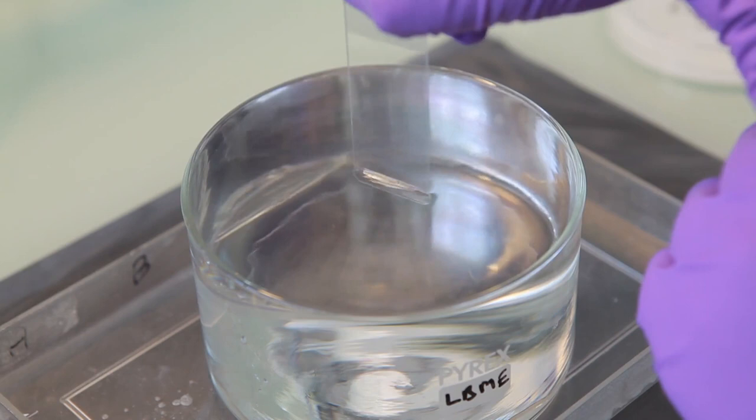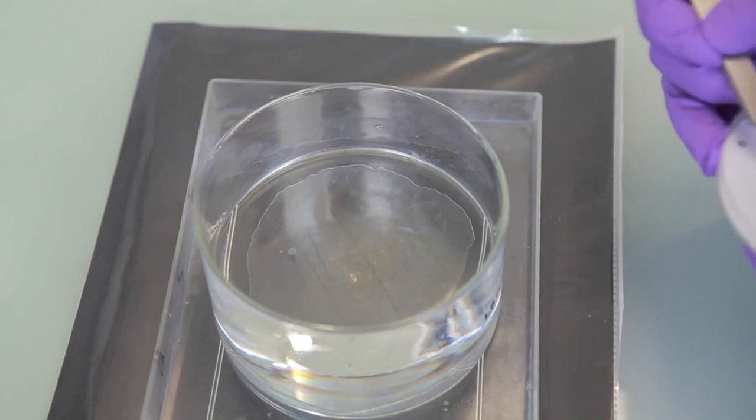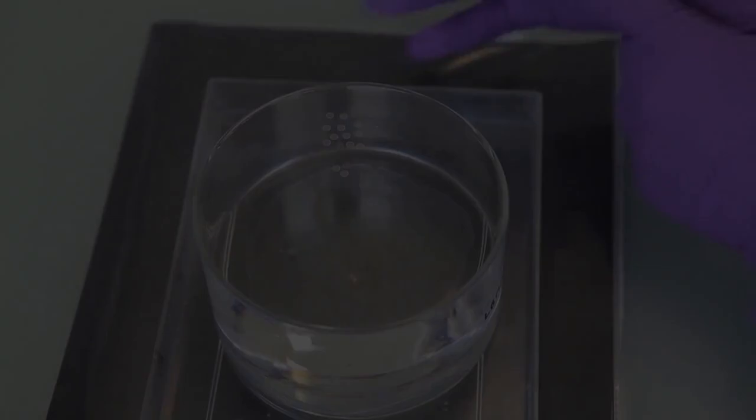Dip the slide into a beaker filled with distilled water so that the Formvar film floats off onto the water surface. Carefully place acetone clean grids on the film's shiny face up with a 12mm diameter cover slip on top of some of them. They will be used for the thickness assessment experiment.